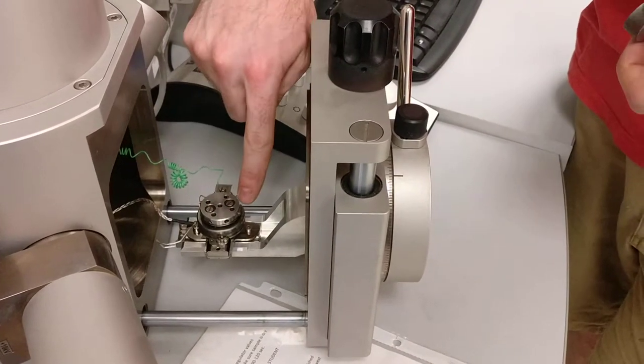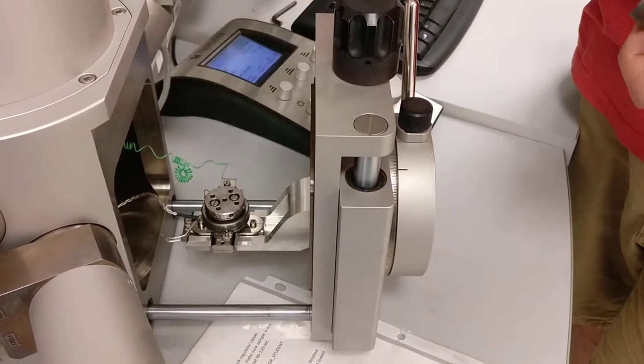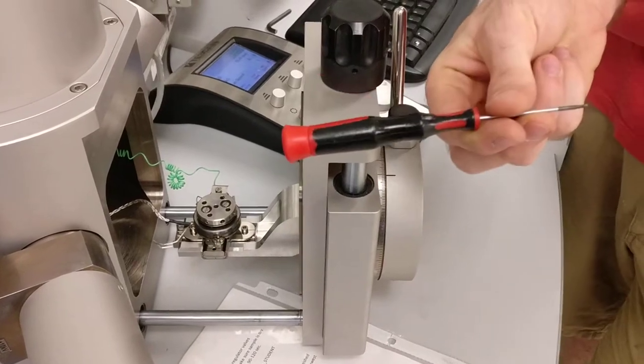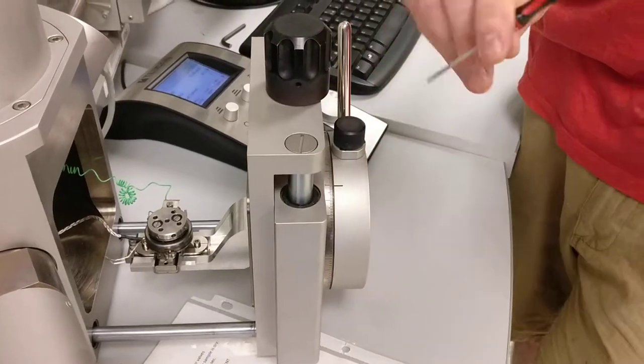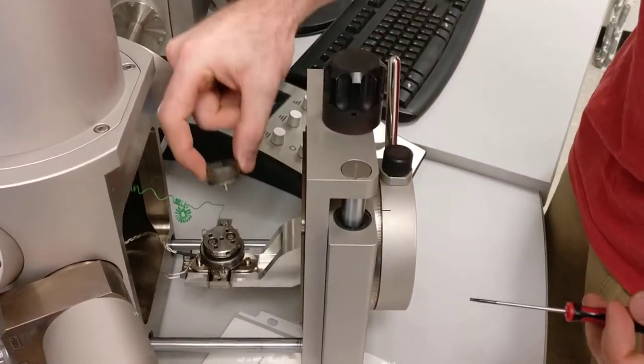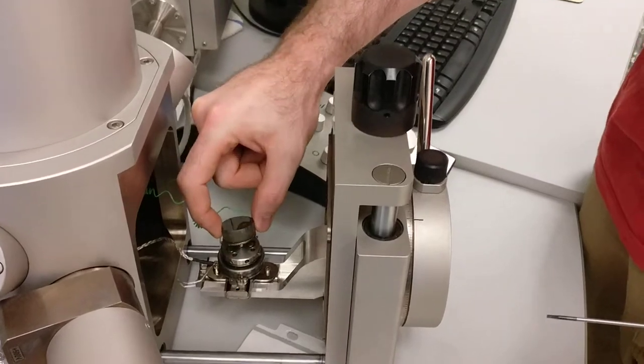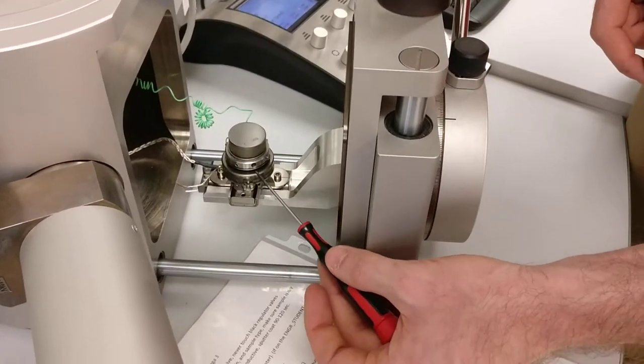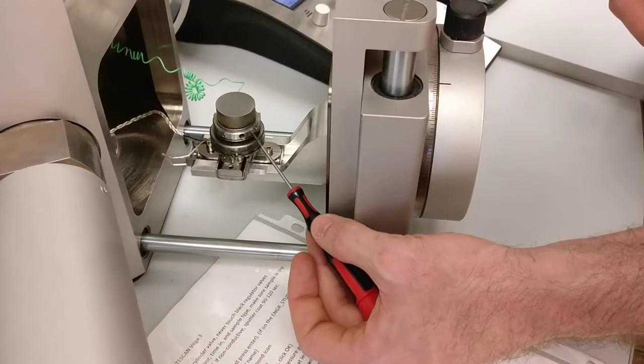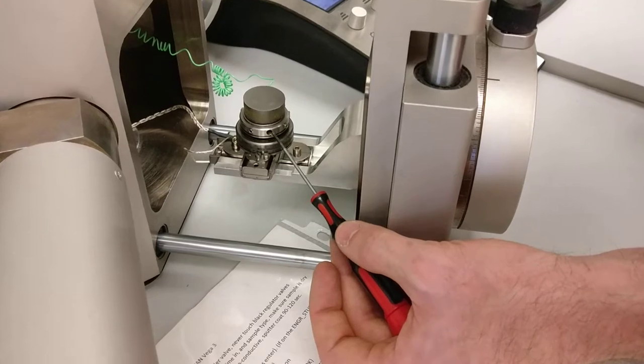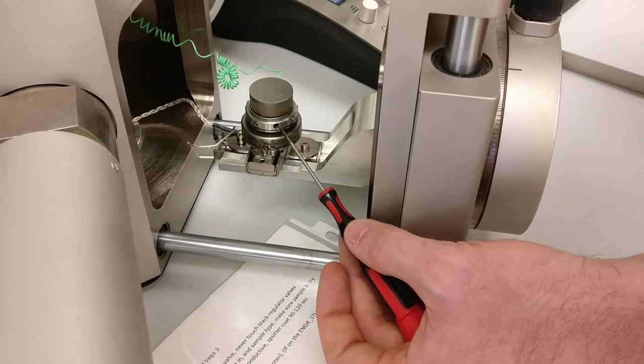We're going to look for this red screwdriver, and for the big stubs, we're just going to use the center hole, and you're going to look for this dark circle on the side of the stage.